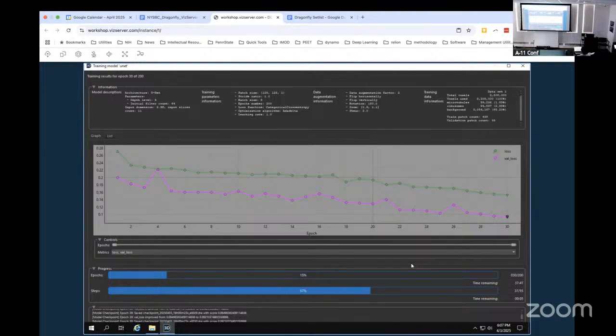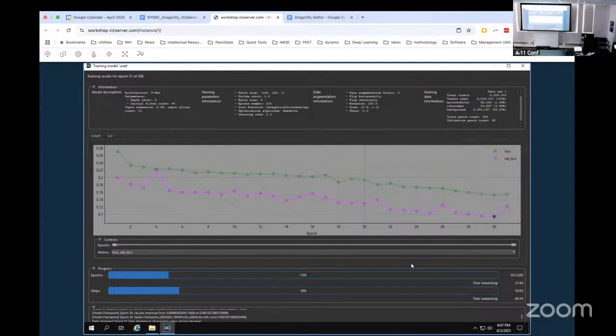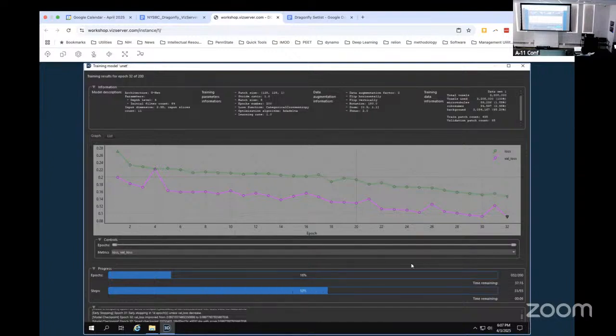Yeah, that's the whole point. So I coded the units and sets similarly. The idea is you push them into the cassette and load it. We'll just call it qualitative data, not quantify any of our images. We've always been looking for a way. It's probably designed with volume imaging in mind, more than the regular image. People have done that.